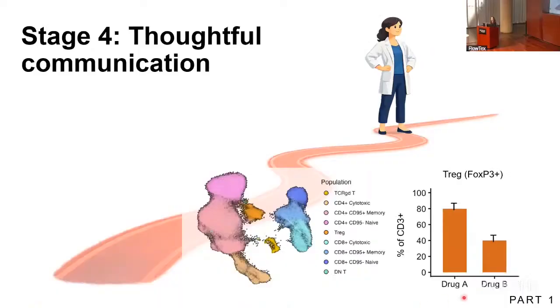Thoughtful communication. It's when you realize that if you show your colleague your UMAP and they have no idea that your CD8 T cells went down after your novel treatment was administered, then you're not really communicating your story at all. They're not getting the main idea, which is that your drug, your treatment, your condition showed a remarkable biological difference. And that is the main point.